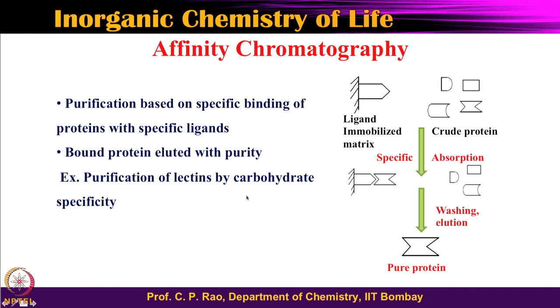Then use another medium to detach this protein to come out of this. So, you see, let us say this is your column which has some molecule, or you can call it a ligand, and this particular ligand will have a specific interaction or specific affinity towards another protein. This is not just a size characteristic, it is a chemical characteristic. So, it is basically a chemical kind of affinity, do not take it as size. The previous one is based on size, the pore or the bead size, not here. Please do not take this as a size characteristic, though it is shown somewhat similar to that.